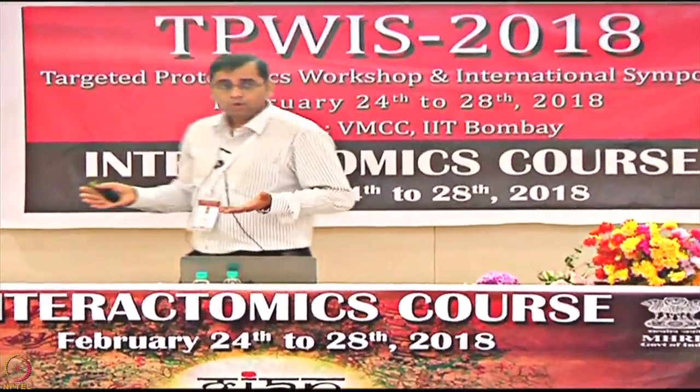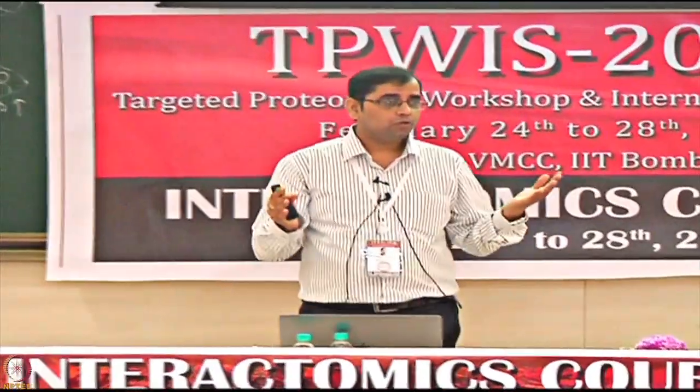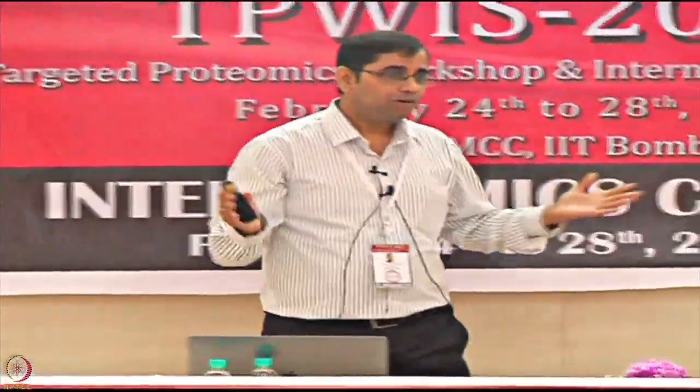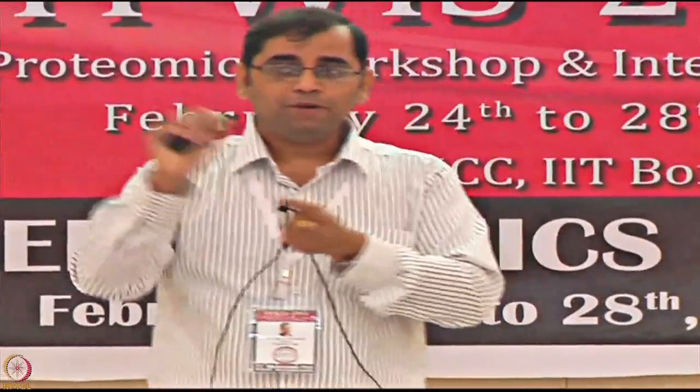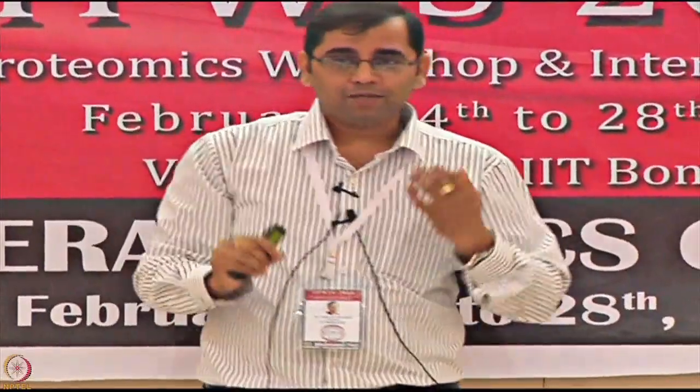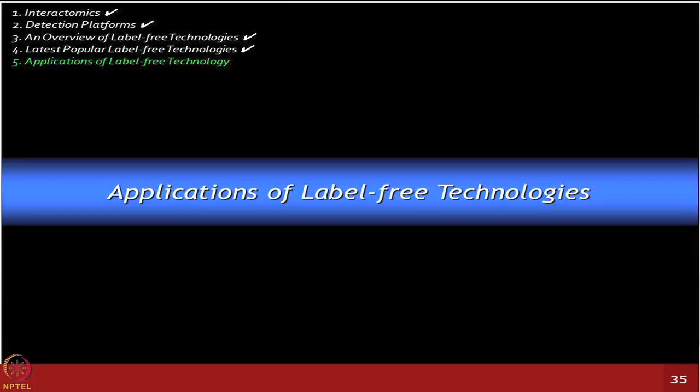So a good approach can be: from the microarray experiments, you have got leads, let's say 200 molecules of interest now. You can go to BLI to narrow it down further. Then you can probably use Biacore to test how many of those you now want to measure the exact on rate and off rate for, right? Okay, so there are many label-free platforms which are possible.